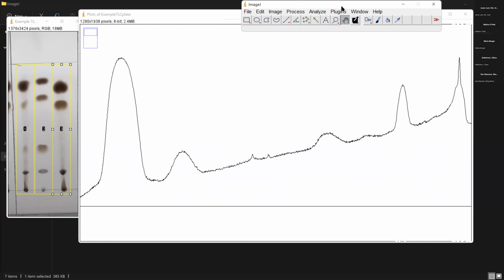Now, going into the next steps of ImageJ that you will find helpful. This is going to be step 10. Right now, all we have is these nice peaks, but what we really want to do is convert it to area so that we can create those lipid ratios and then compare it to our spectrophotometric lipid ratios.